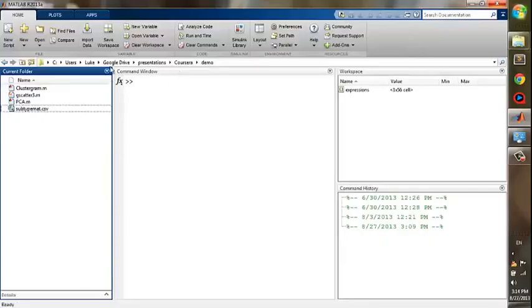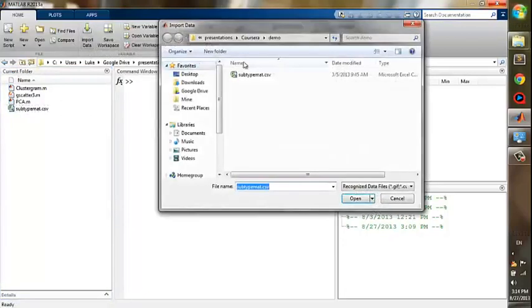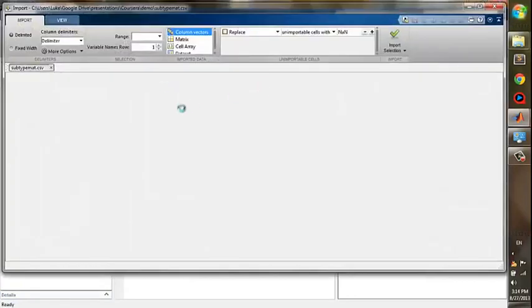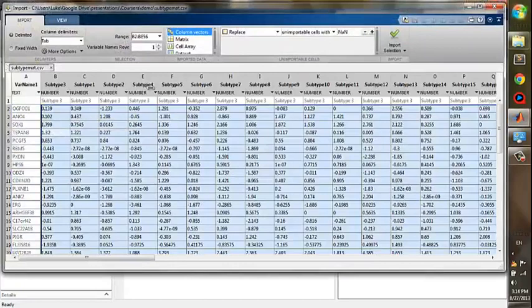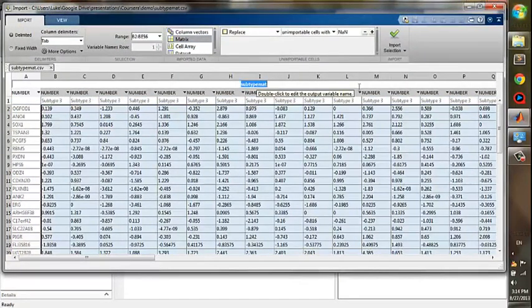Now, we will begin our PCA plotting in MATLAB. First, import the data from a CSV file. Click Import Data button. Select the CSV file. Wait for loading. We first import all the numeric values as a matrix. We select the matrix and give the name as expressions. Then click Import.